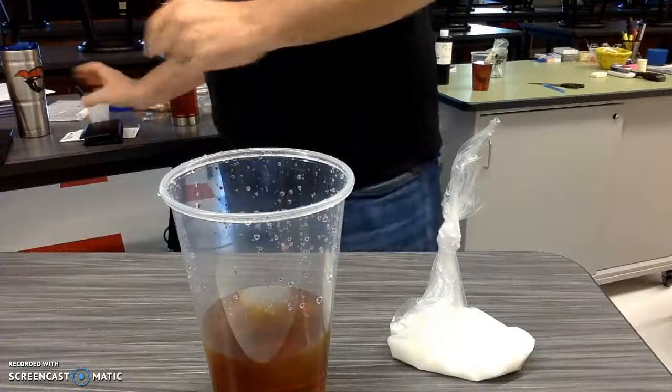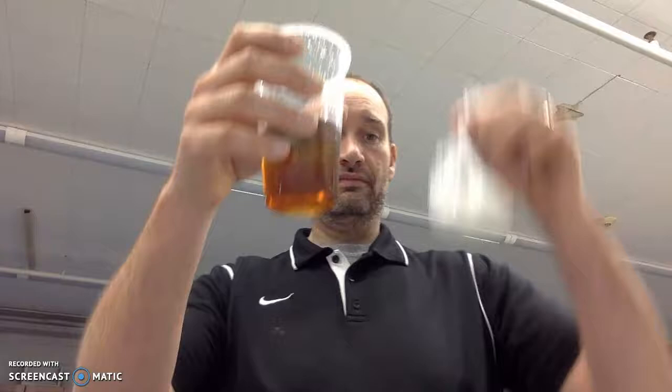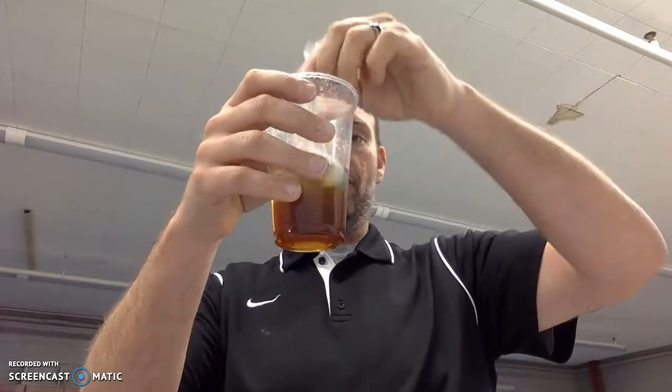Now, in this lab, here's my iodine. Here's my cornstarch. And I'm just going to dunk it in there like that. I'm going to leave this for 15 minutes. At the end of 15 minutes, we're going to take it out.